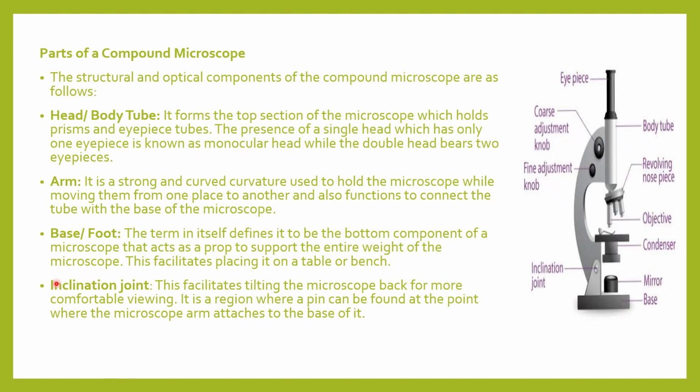Next we'll move on to the parts of a compound microscope. As you can see in the picture over here, this is the compound microscope and these are the different parts of the compound microscope. So let's study them one by one.